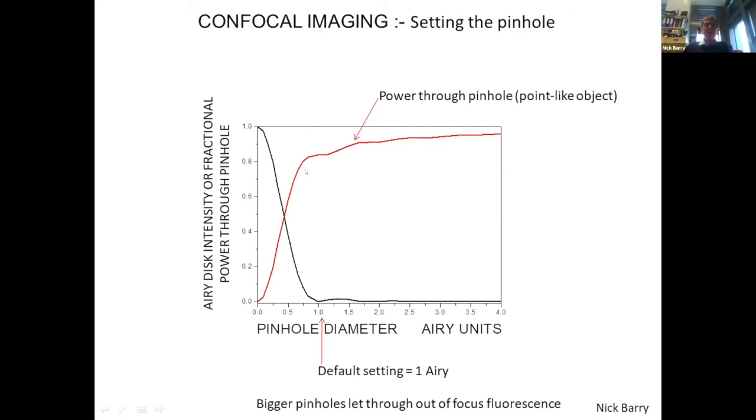Power through the pinhole is something of the order of 80 something percent at 1 Airy unit, and then after that you get a very small improvement.